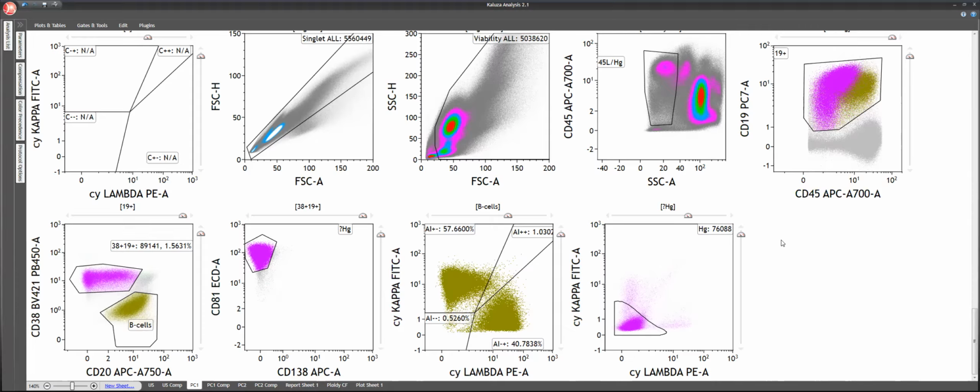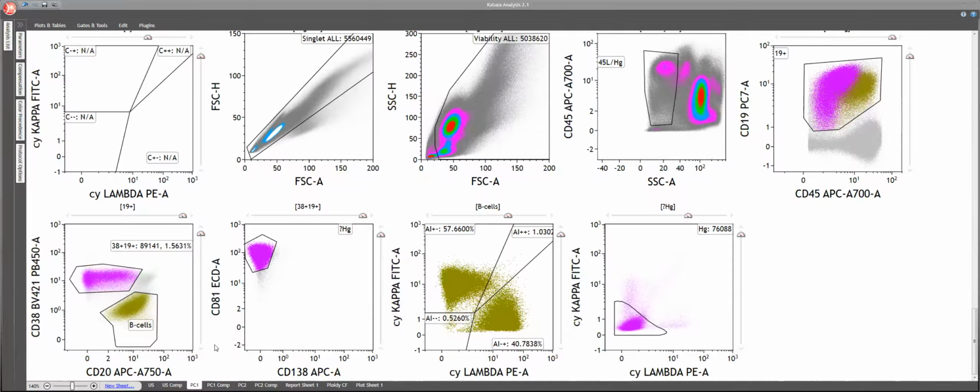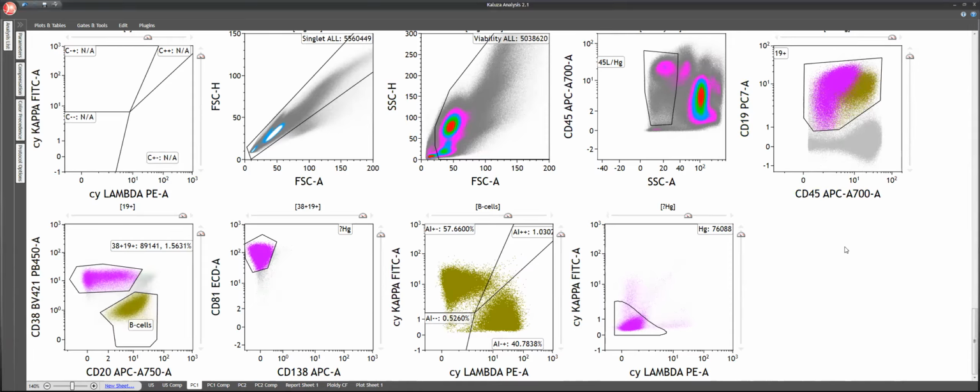And these are 76,000 hematogones in 5 million cells, which if we calculate, 76,000 divided by 5.4 million cells basically, would be 1.4% hematogones. Hematogones more than 0.05% indicates a representative bone marrow. So your hematogones are 1.4%, which means the marrow is quite representative.